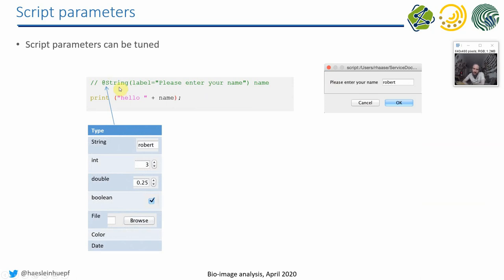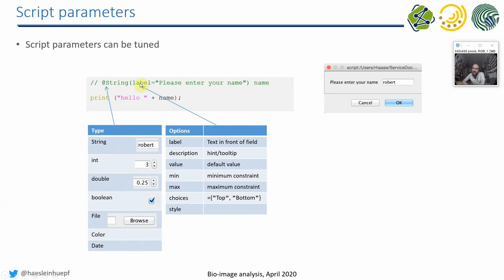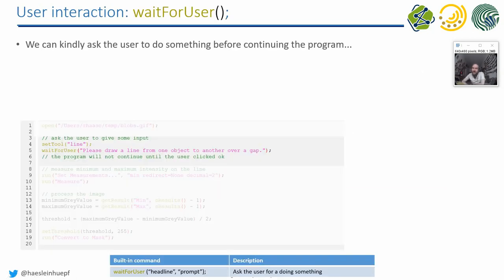So you can either have strings, integers, doubles, booleans, files, color dates. You can configure the label description. In case of spinners, for example, you may want to have a minimum value and a maximum value, stuff like that. And by the end, there comes always the variable name.